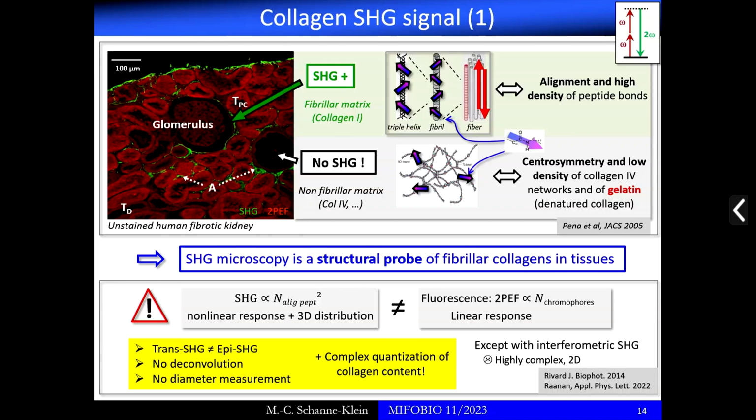It has been performed in two groups: first, the group of François Lecarré in Canada, and the group of Dan Oron at the Weizmann Institute, who had done some deconvolution by taking into account the phase. But any other attempt to do deconvolution is not relevant.